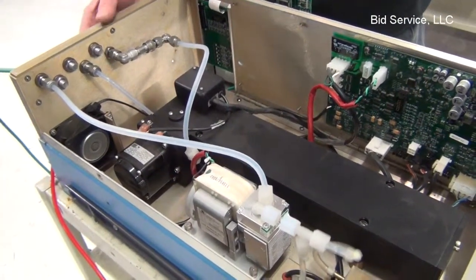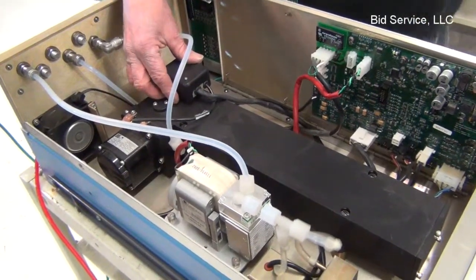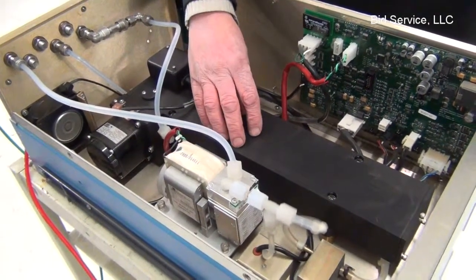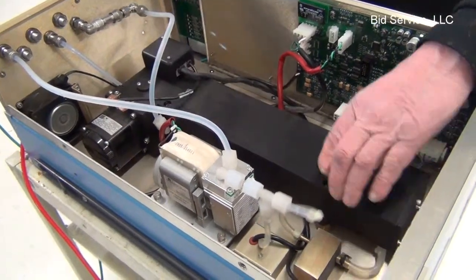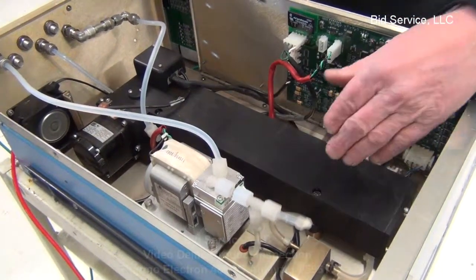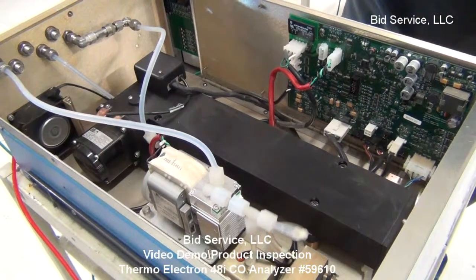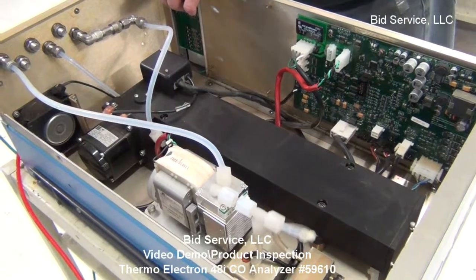The sample gas is pulled in from a port in the back and immediately goes through a series of filters. These filters are there to take out any particles that could conflict with either the optical or infrared components inside the heated optical bench. Once the level of carbon monoxide is detected, the information is sent to an interface board, and in turn sent to the motherboard, which then displays the rate of sampling either on the front display or through a series of different expansion ports on the back for computers.